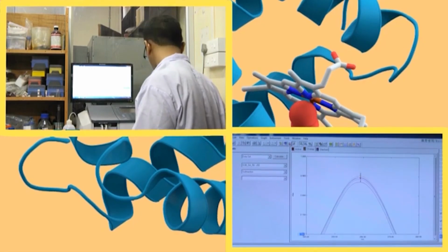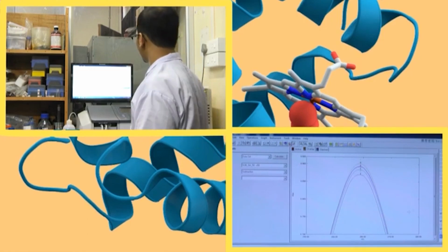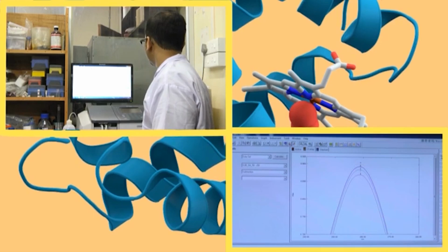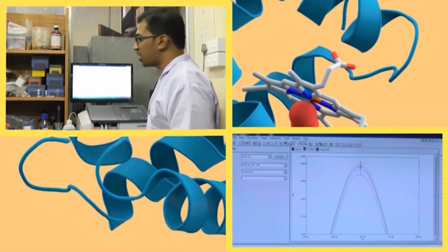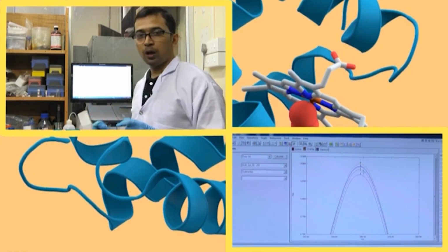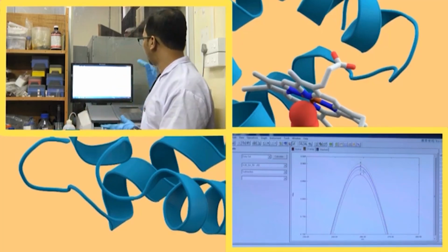If we change a bit like 0.7, 0.92. Okay. So, here we can see we have completed the subtraction, and this one is for only gallic acid. Out here the absorbance in addition of HSA, when you have subtracted the control, that is only HSA, decreases. However, here we can see 1 or 2 points, the decrease is not in a regular trend, like 3 are decreasing and again 2 are increasing, but the absorbance value is lower than gallic acid.